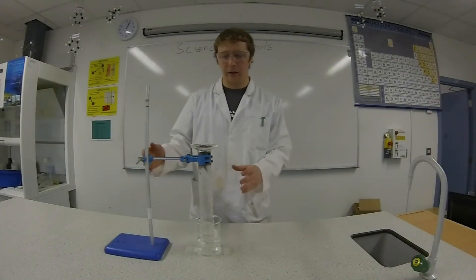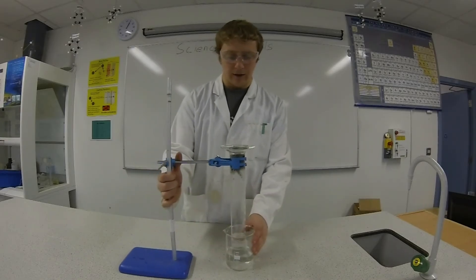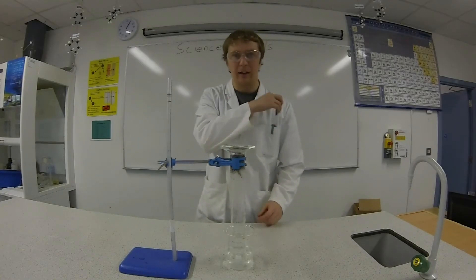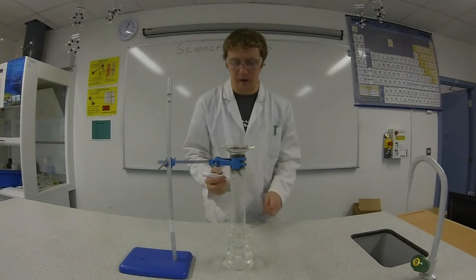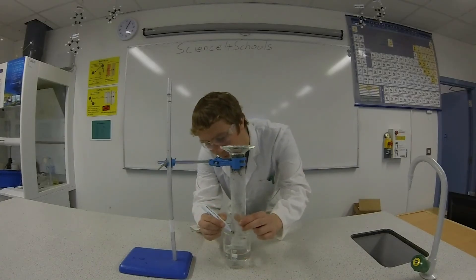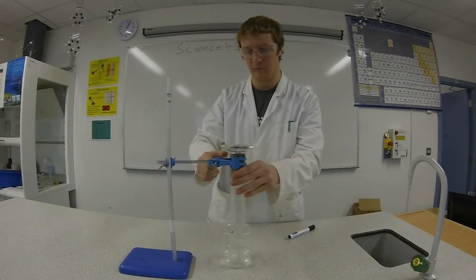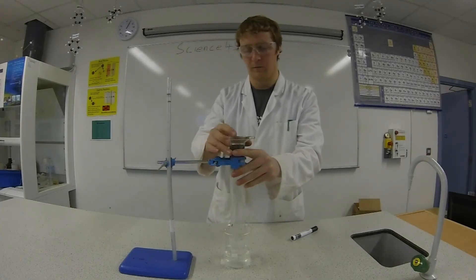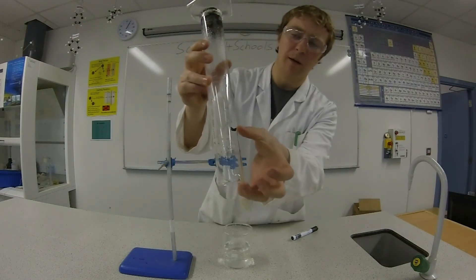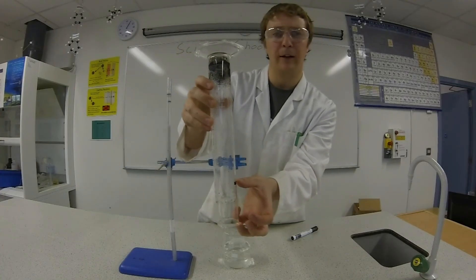Okay, so we left our apparatus set up overnight and you can see that the water has actually risen up the graduated cylinder. So we're going to just check how much it's risen by. I'll get a marker and just mark the level of the water. You can see the water rose by about that much, which is approximately one-fifth of the graduated cylinder.